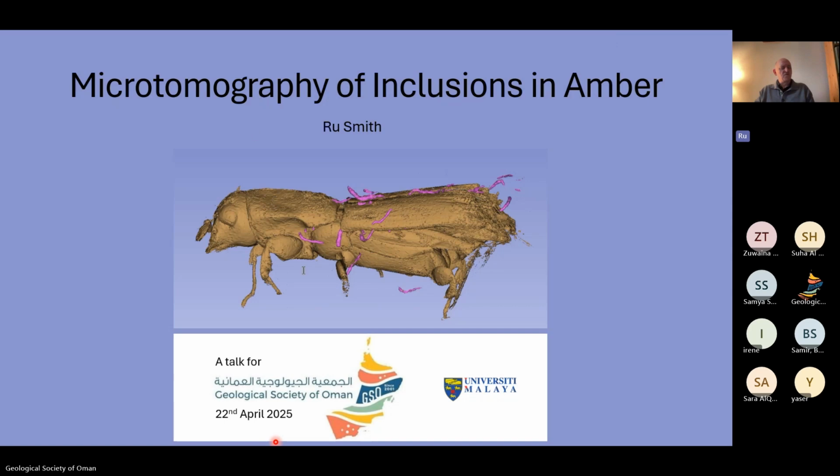They were little arthropods, I think, in bitumen in Oman. And I'm forgetting the details now. But yeah, if there's no density contrast, you won't see anything, basically. And you might be in the case where I was here with very low density contrast in the amber, where you end up doing a lot of manual work, a lot of manual interpretation line by line, like in seismic.